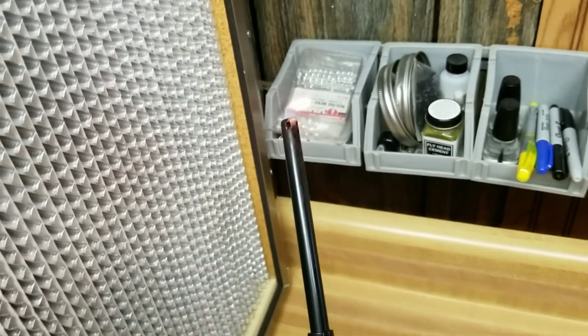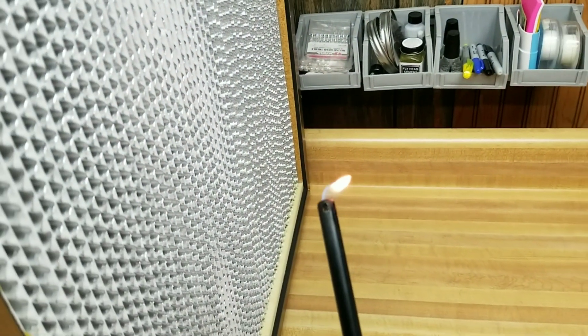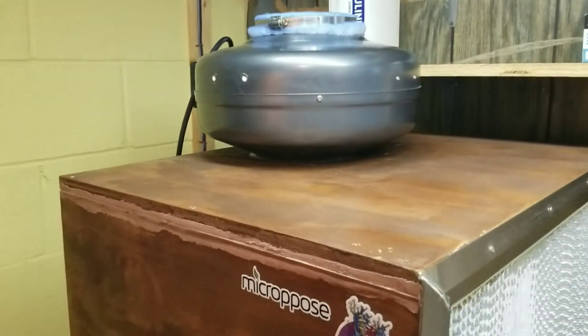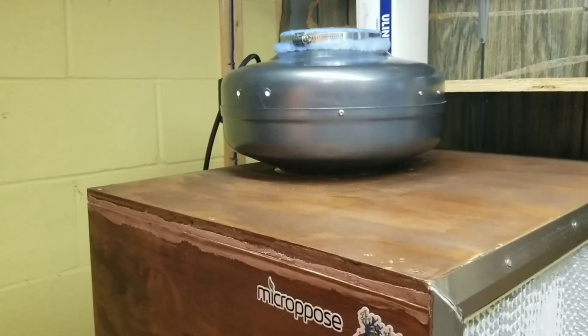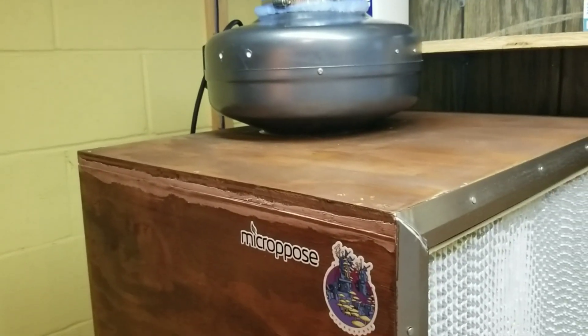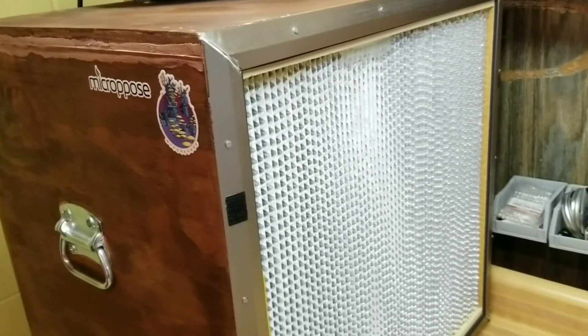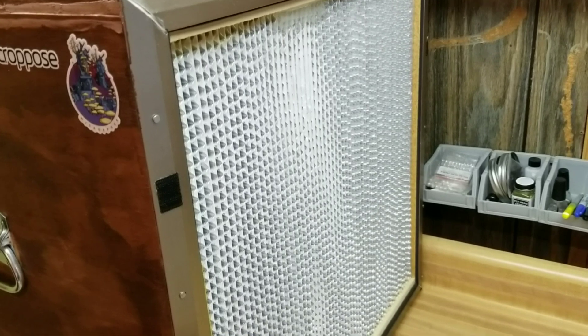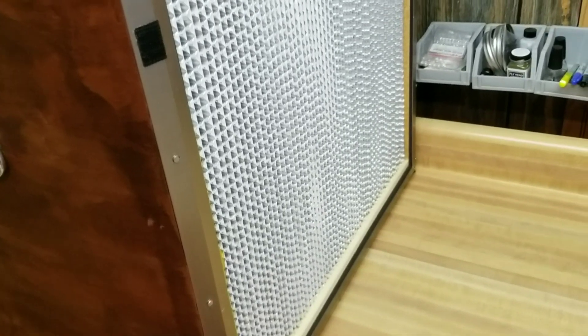If it blows your lighter flame out, you probably have a little too much flow and you might need to dial it back a little bit. That's where, like I said, every one I build from now on I'm going to use the centrifugal fan — I really like these fans — but I'm going to use one that can use a rheostat so you can adjust the airflow pressurizing your box, because that's really useful. There's some inconsistencies with the filters and it's nice to be able to control your airflow with a single fan and dial it back a little bit if you need to. But anyway, that's the lighter trick — that's how you can test your flow.